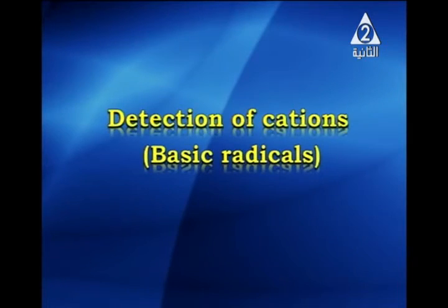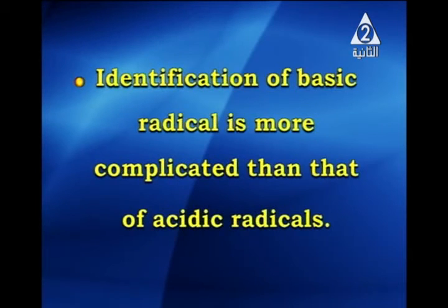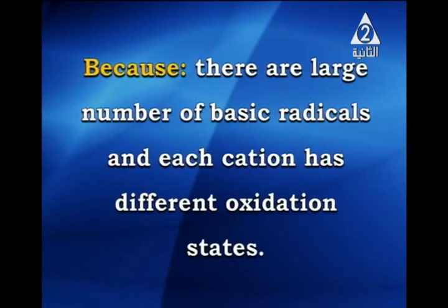Detection of cations, which are called basic radicals. We have given the reason in this title. Identification of basic radicals is more complicated than that of acidic radicals. The reason is that there are a large number of basic radicals and each cation has different oxidation states.